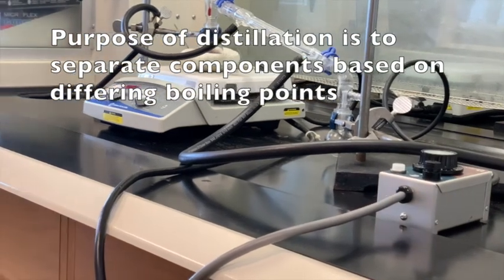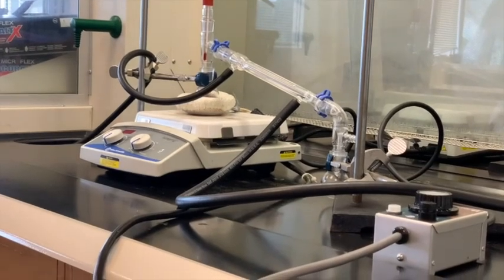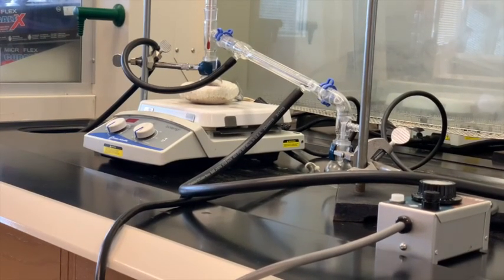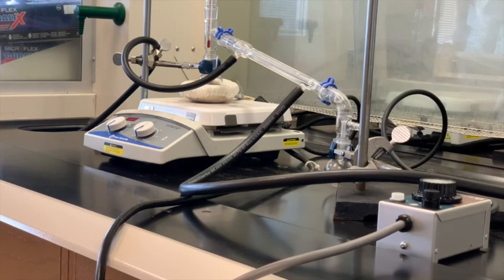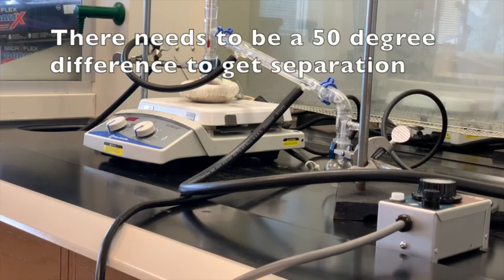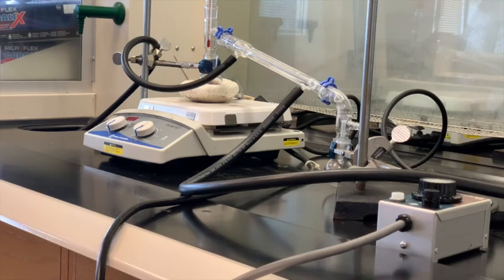Now the whole purpose of a simple distillation, or any distillation in general, is that you're trying to separate two substances that differ in their boiling points. We're separating the methylene chloride from the crystal violet. The crystal violet is actually a solid that's been dissolved in the methylene chloride. The best benefit of doing a simple distillation is whatever you're trying to distill, there has to be at least a 50 degree difference, 50 degrees Celsius difference in their boiling points, in order for it to be a successful separation of components. Simple distillation is just another method of purifying a mixture, separating them based on their boiling points. The methylene chloride has a much lower boiling point than the crystal violet, so we have no trouble of having that at least 50 degree difference.